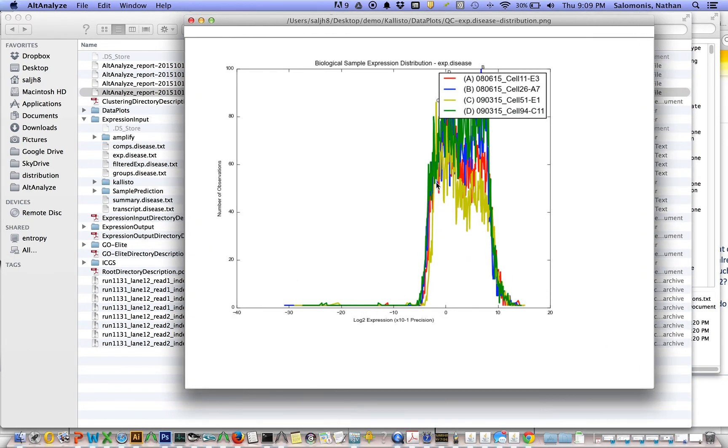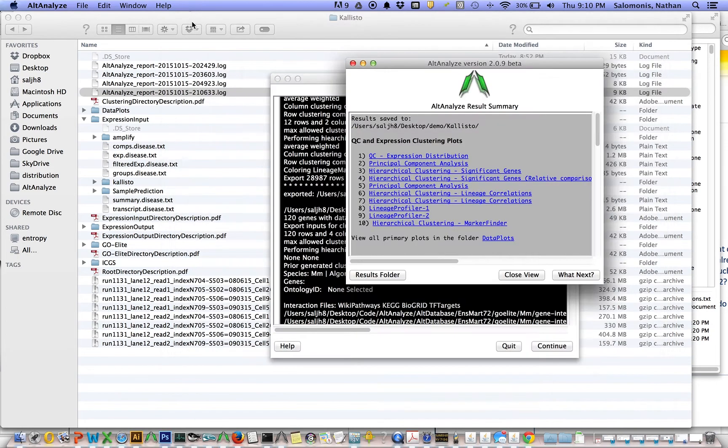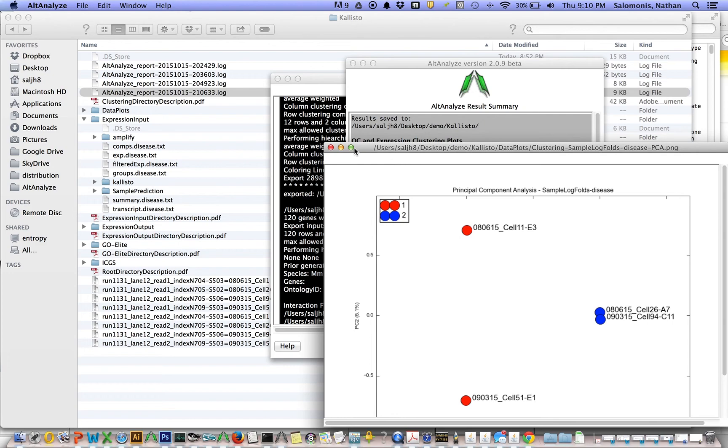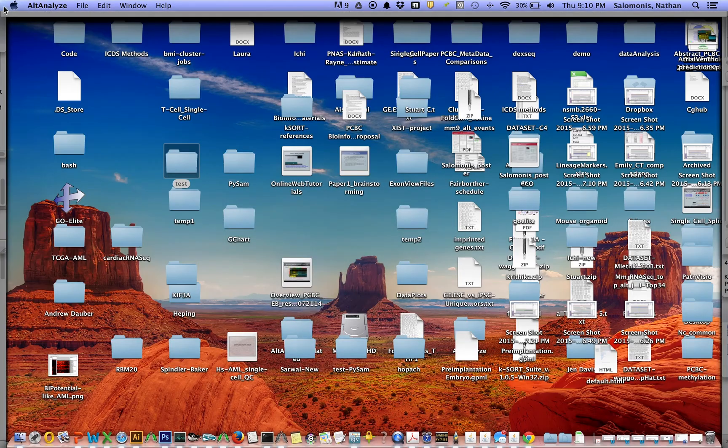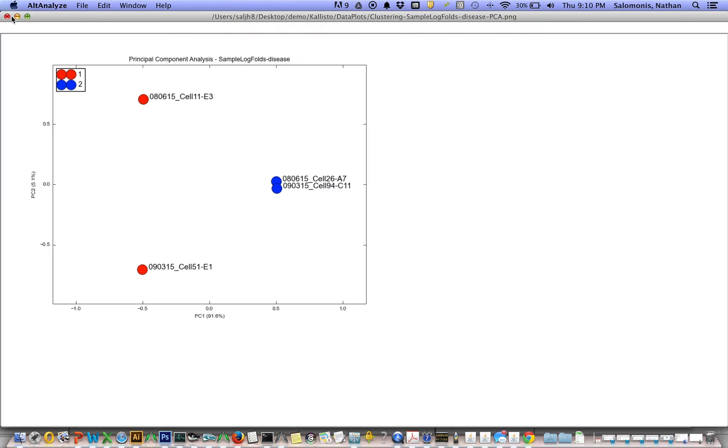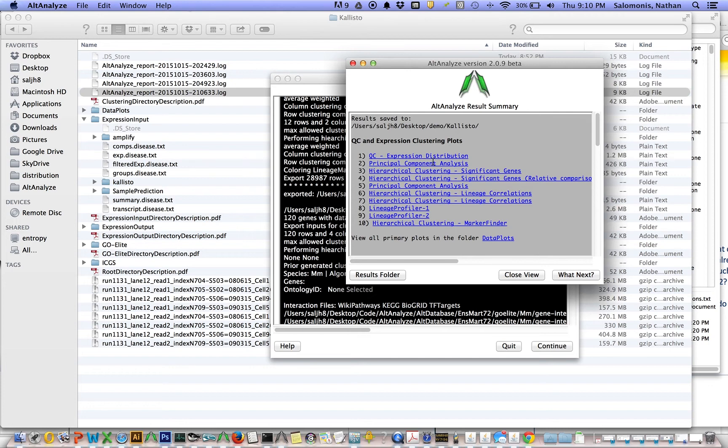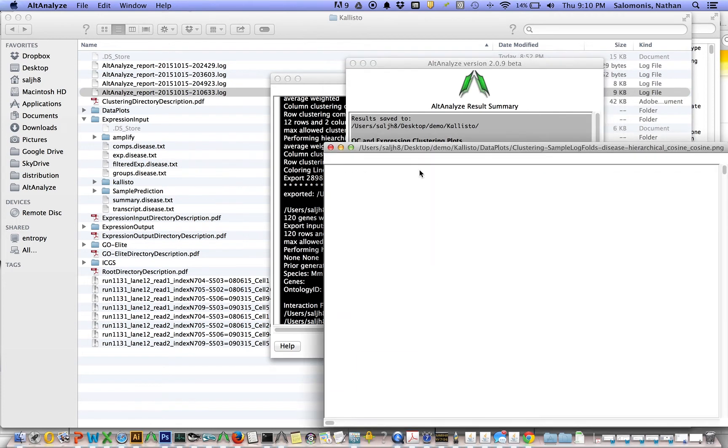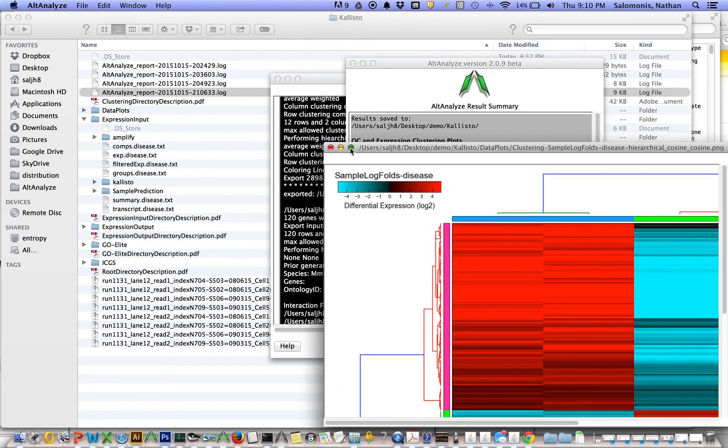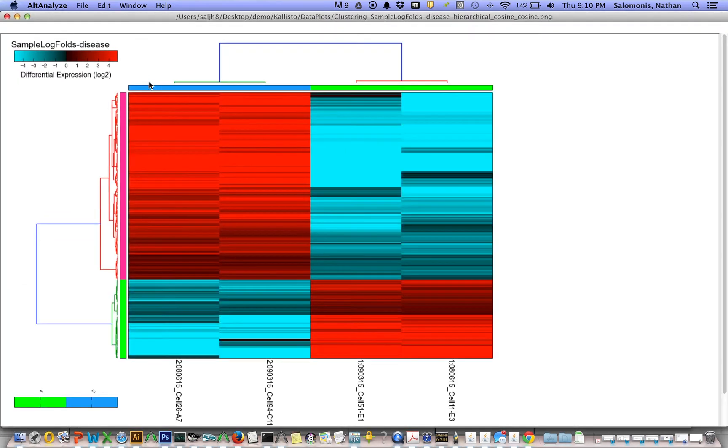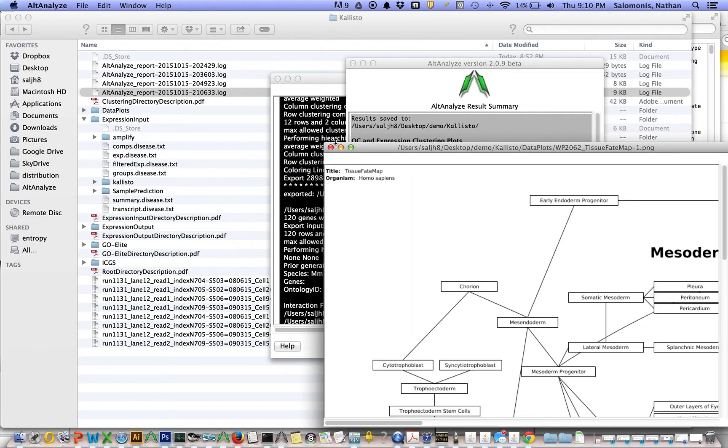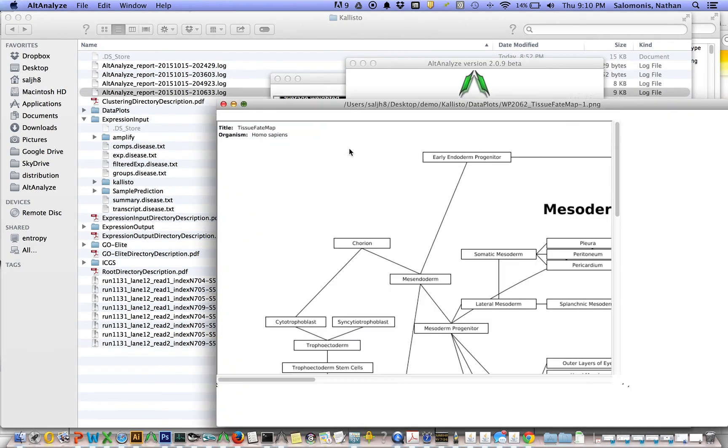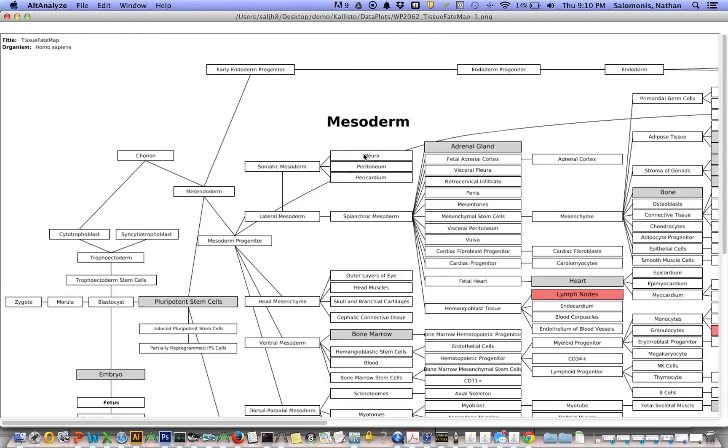This summary window will display what are some of the QC plots that come out of this analysis. This is the distribution of expression values. These are the gene level TPMs, principal component analyses, hierarchical clustering results.